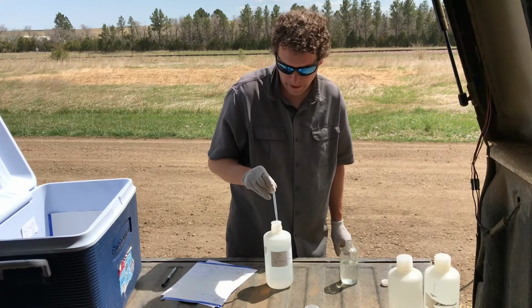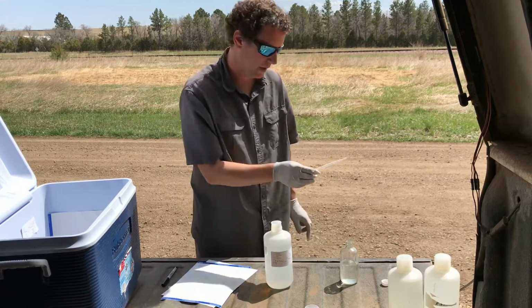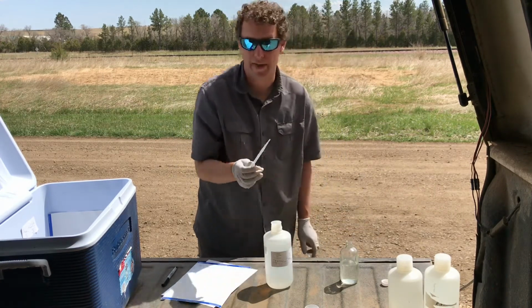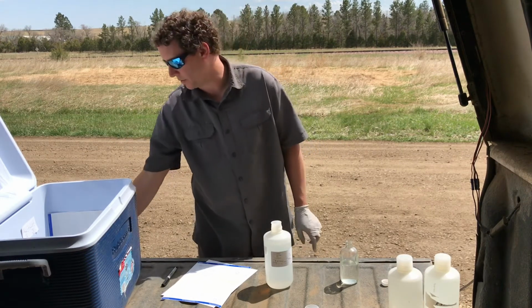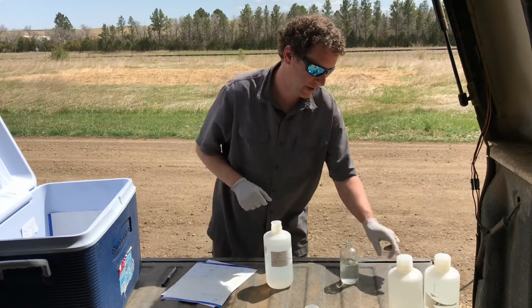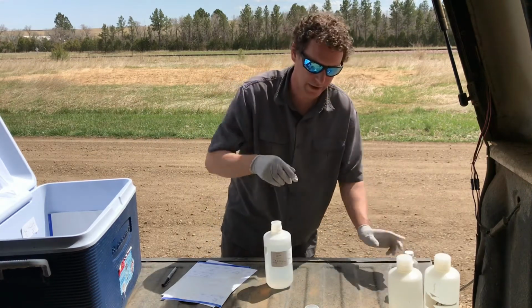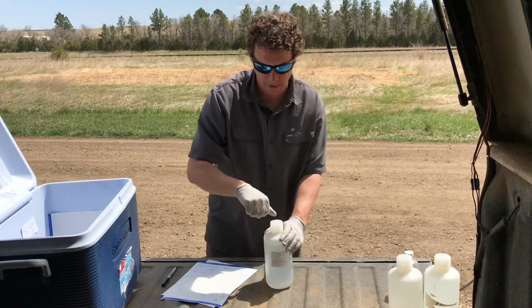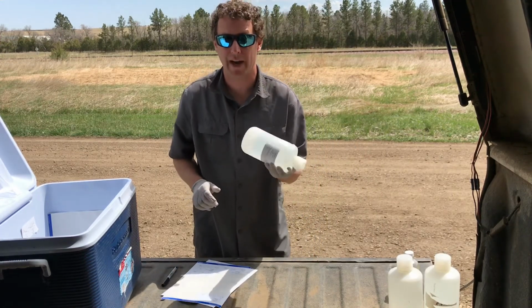Be aware of which way the wind is blowing. Acid burns hurt, I can tell you from experience. Once you've acidified that sample, dispose of your pipette in a safe place so nobody gets an acid burn. And the first thing, cap that acid bottle and set it aside where it's safe. Cap your sample bottle, invert it a few times to mix the acid into it.